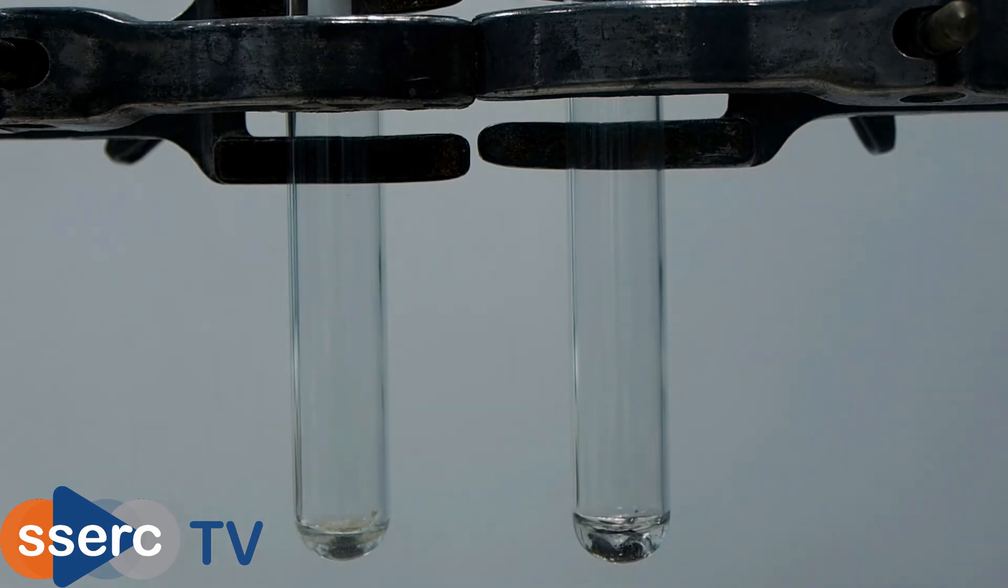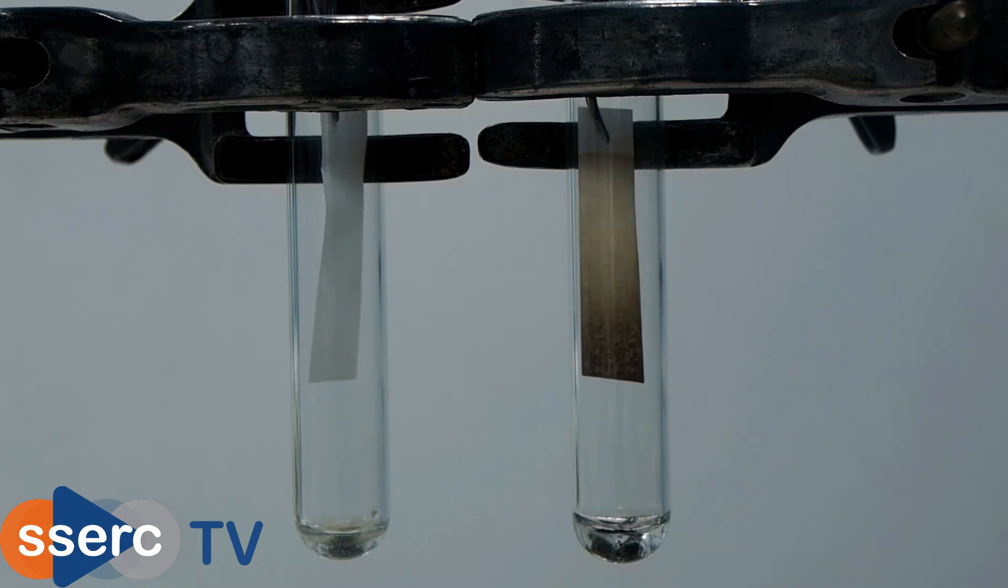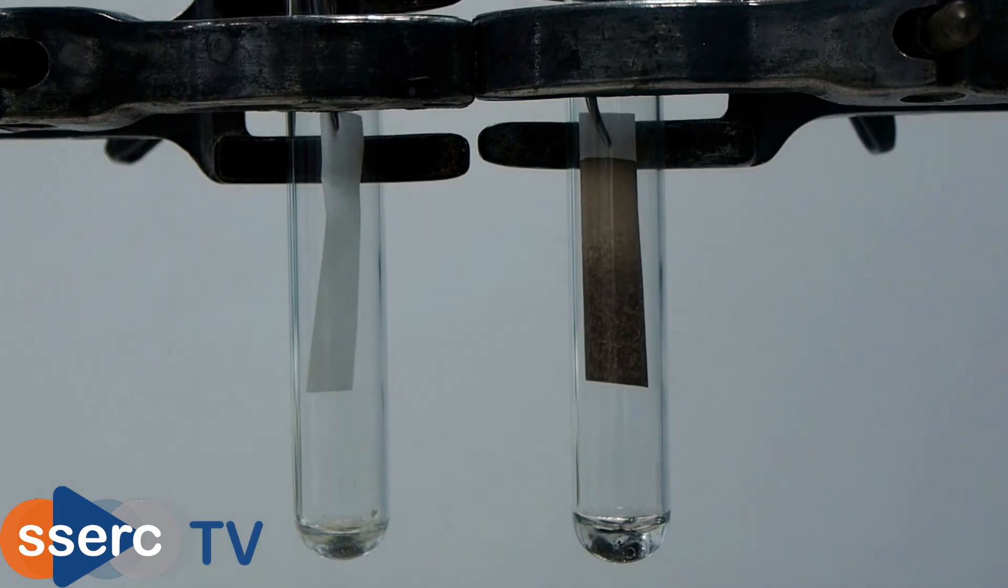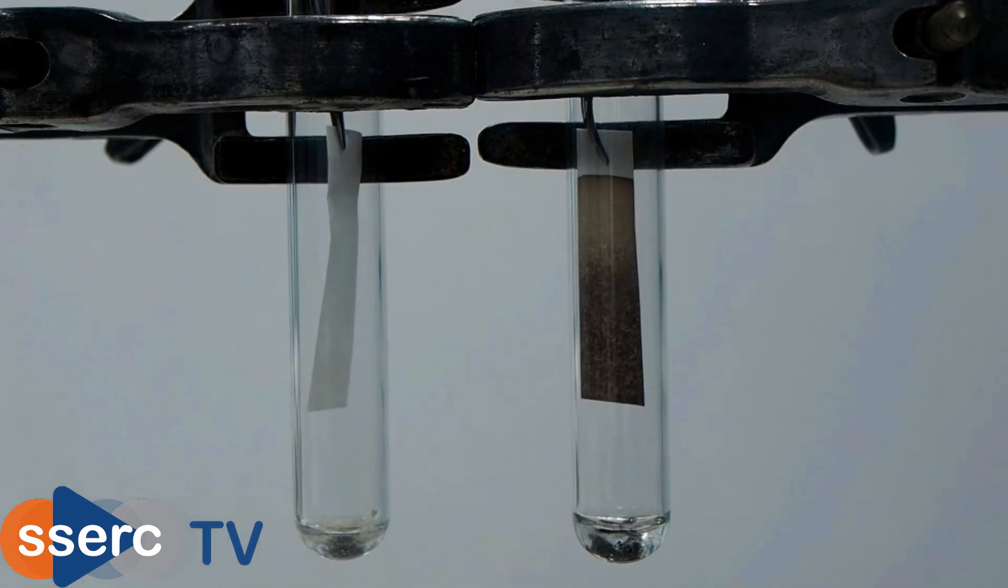You can clearly see that in the tube with our starting materials there is no change, while in the tube with our product the paper rapidly turns black, showing that hydrogen sulfide is being produced and that we have indeed made iron sulfide. And so a chemical reaction has taken place.